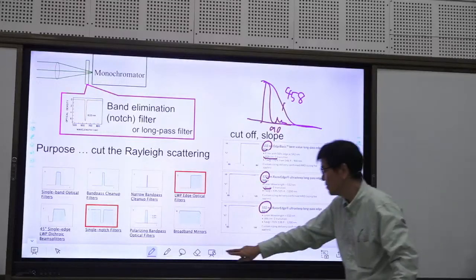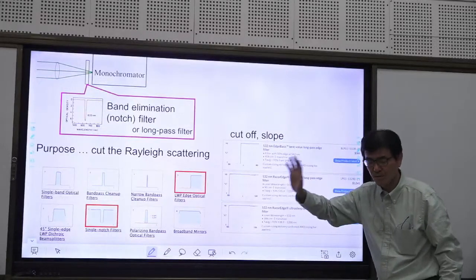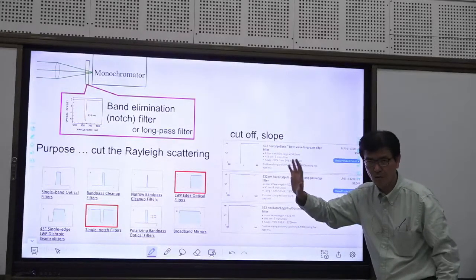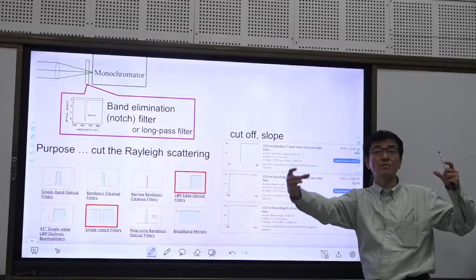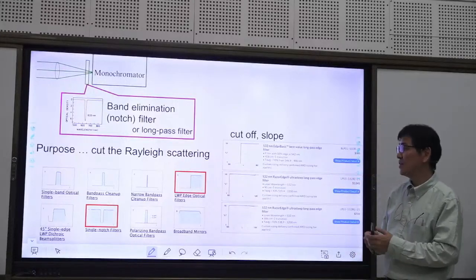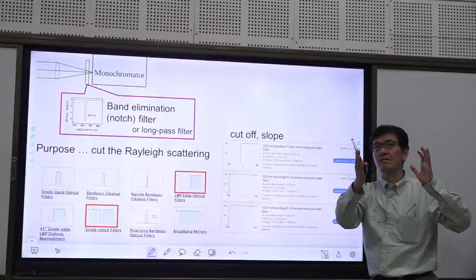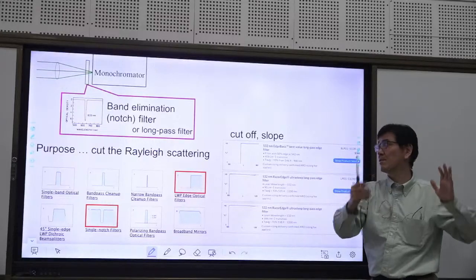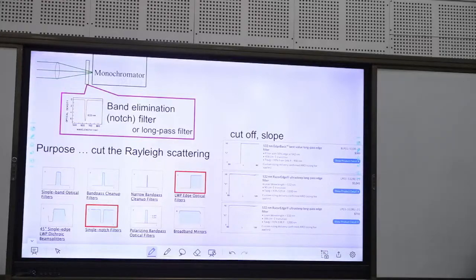So please make sure your purpose, which peak you want to focus on. If you want to detect all the peaks, range should be wider. If your interest is nearly between 1000 to 2000, then such a nice one is not necessary. It depends.